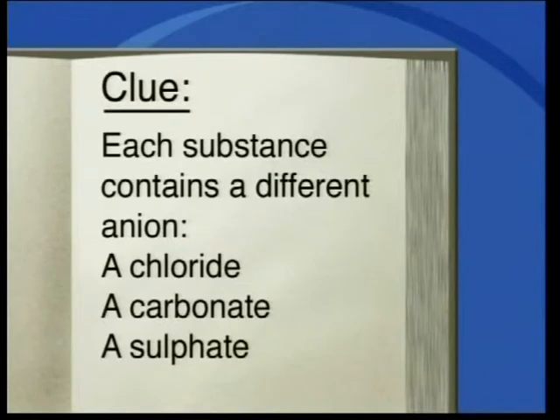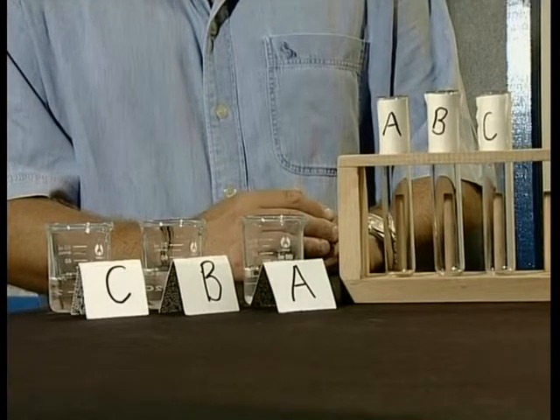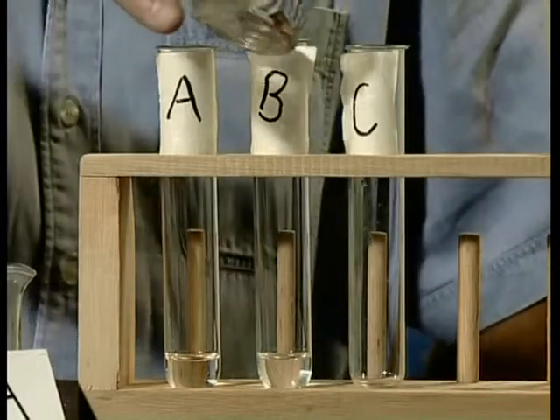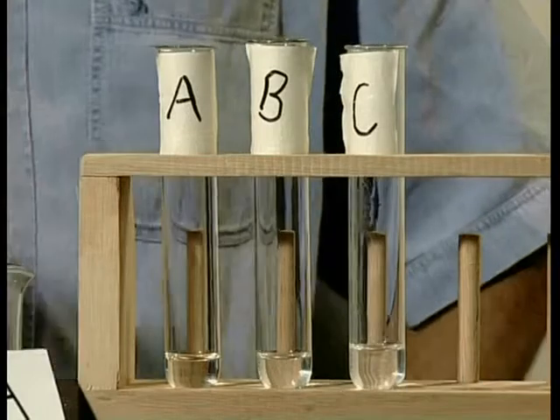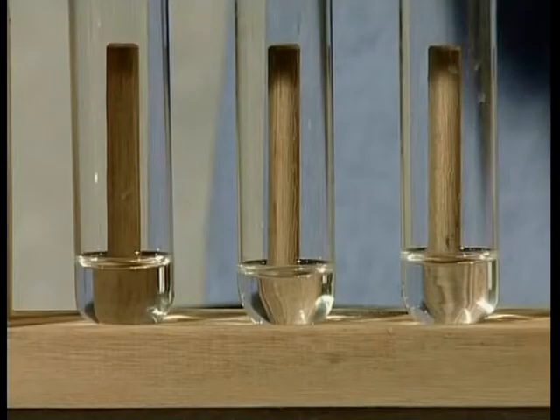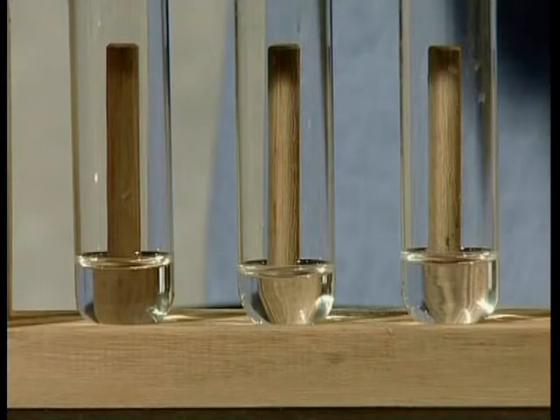Now we need to identify the anions. From our clue we need to find out which one is our chloride, which one is our sulfate and which one is our carbonate. First we dissolve each salt in distilled water to form a solution. We will use small amounts of these solutions to test for the different anions. For each test we must use clean dry test tubes and label them A, B and C. You will notice that all the solutions are colourless. If the test tubes are not labelled we could easily become confused about which solution we are testing.